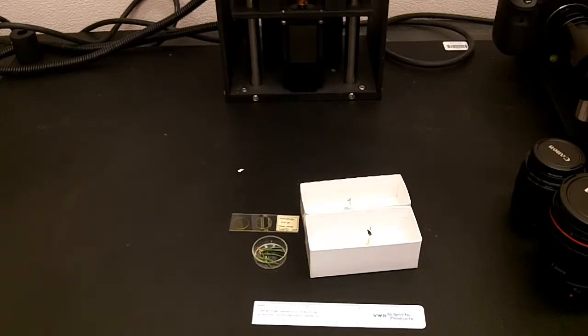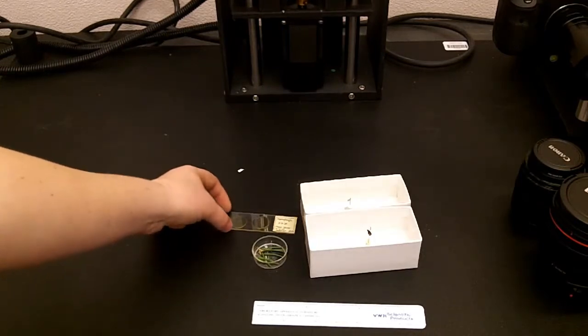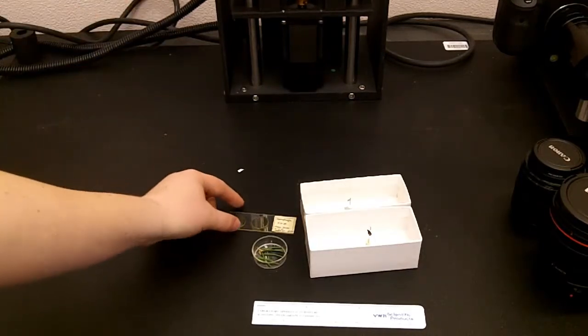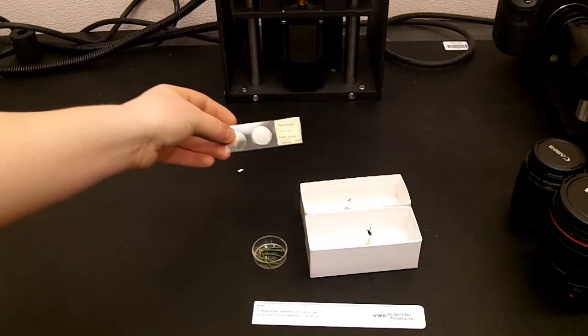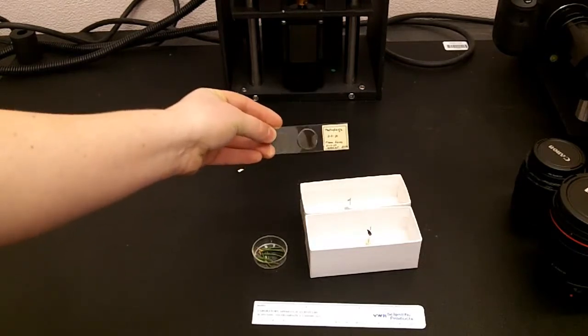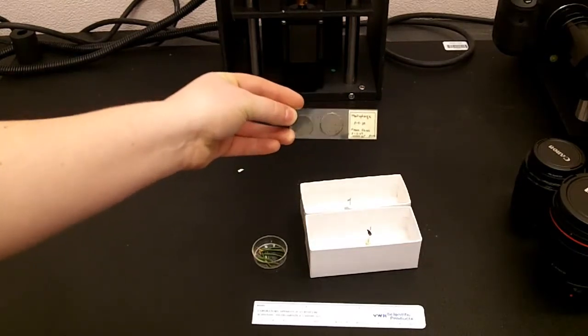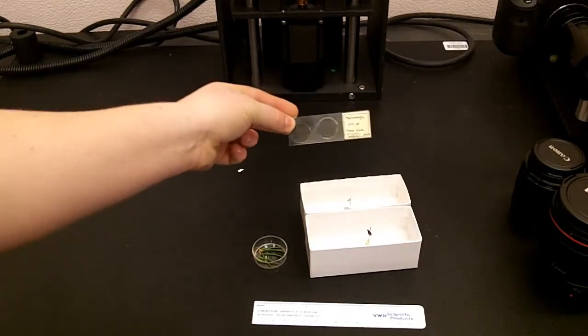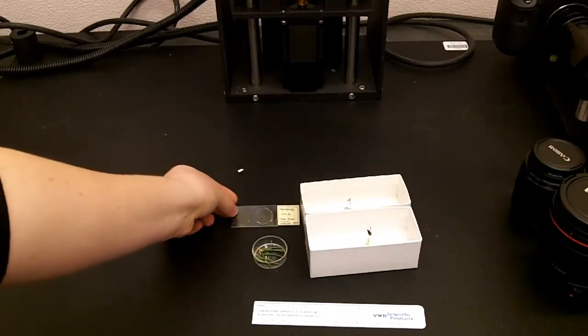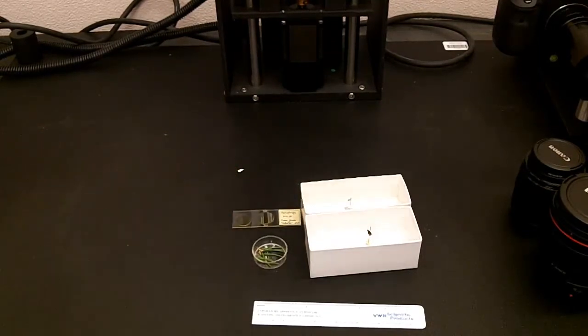So, if you were either pressed for time or you had a very, very small microscopic image, you would want to use the K2. And this slide would probably be better being imaged using the K2 just because the specimens are very, very small, only a millimeter or two in length.